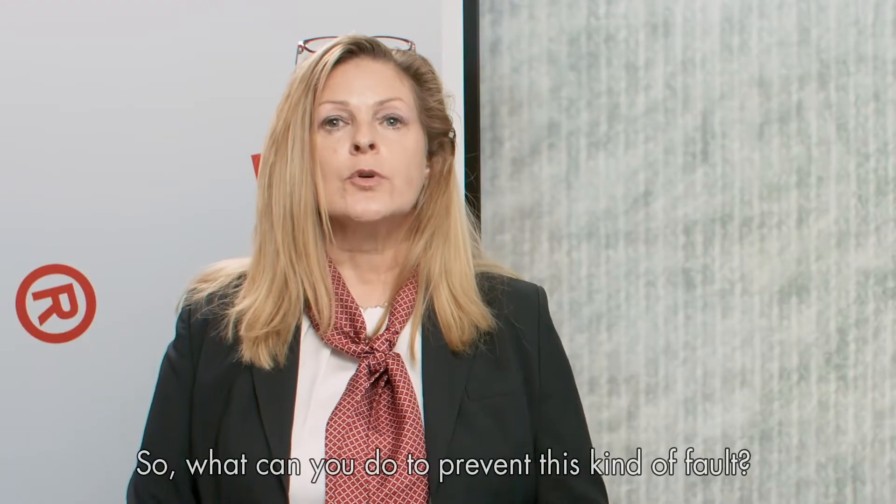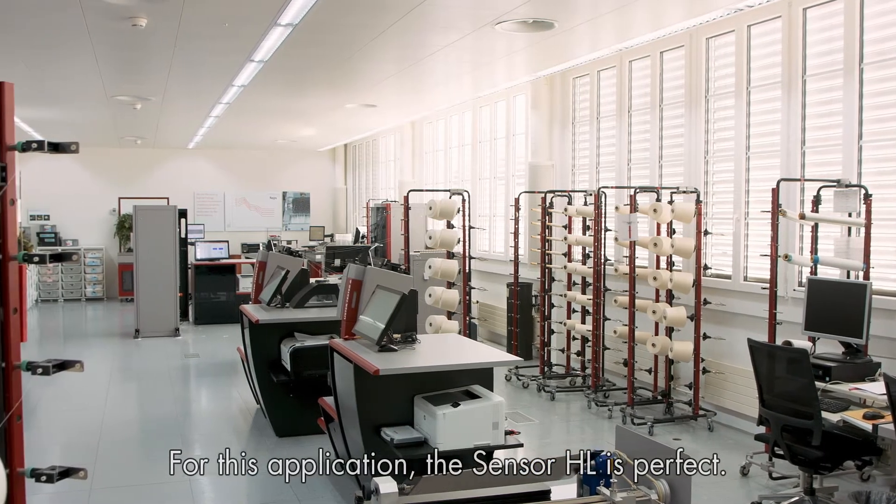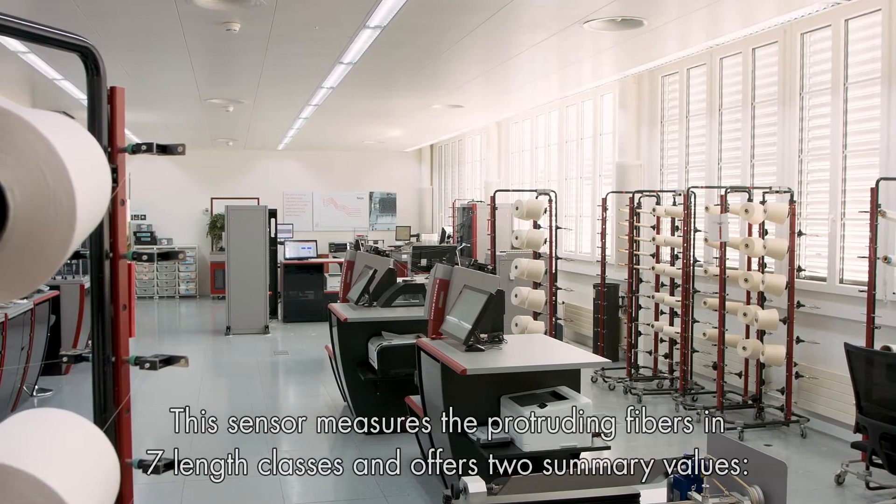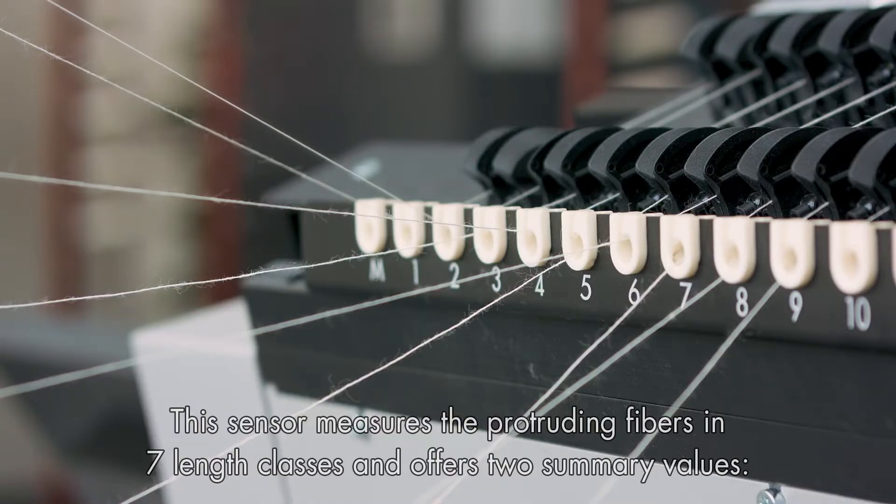So what can you do to prevent this kind of fault? For this application, the sensor HL is perfect. This sensor measures the protruding fibers in seven length classes and offers two summary classes.